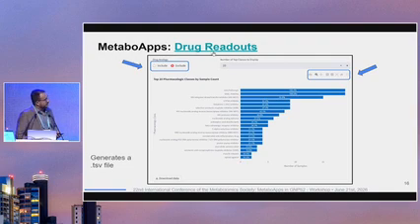This bar here that you have for any visualization on any of those tools, not only the drug readouts, is going to be the same one. It's really interesting because from that you can already use that image from your data for a report, for a paper, for anything that you're working on, because it allows you to take a snapshot directly from that chart.